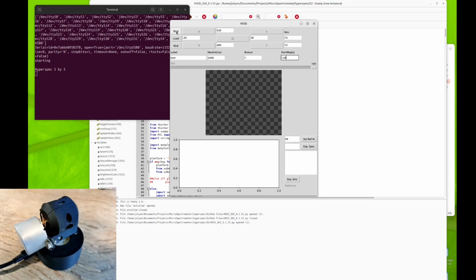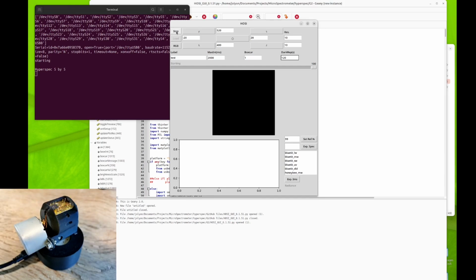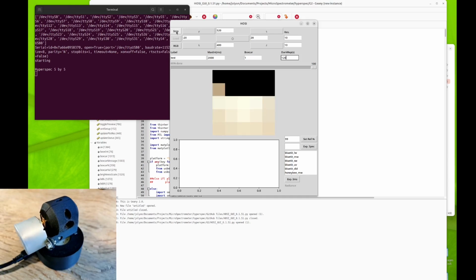So we'll start and take a scan. It starts off by just initializing the sensor, so clearing out those photocells of their charge, taking a dark measurement, and then actually starting the scan. So you can see it scanning back and forth. At the moment it's just measuring this tabletop under an LED light, so nothing particularly interesting.